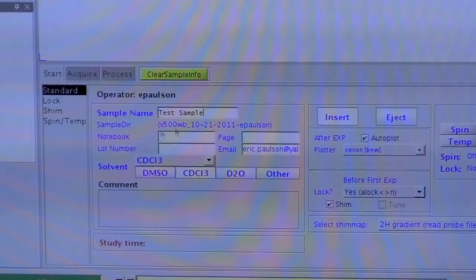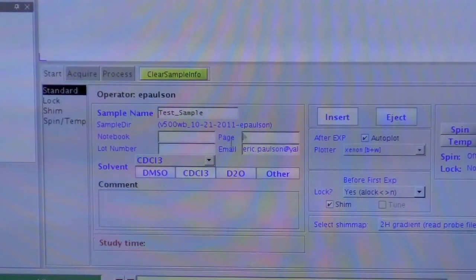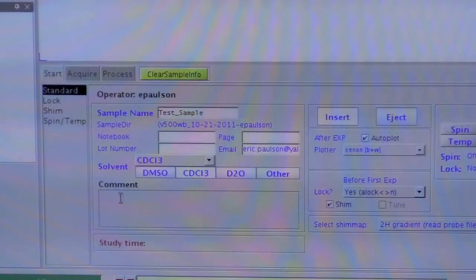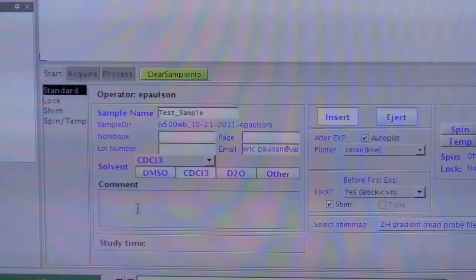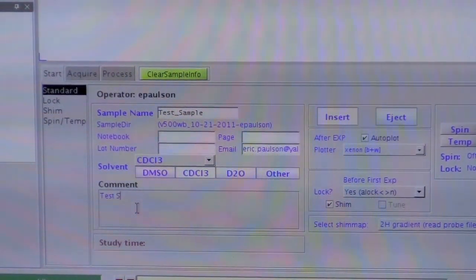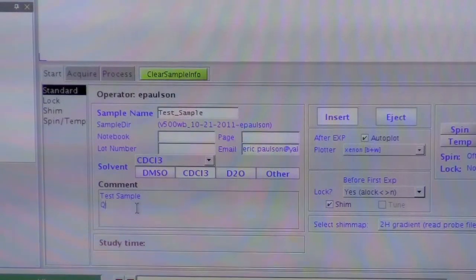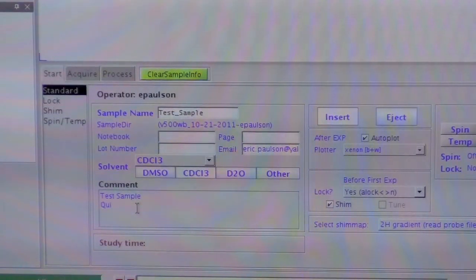You can also fill in these other fields if you want, but those are optional. So this comment box is similar to the title box on the Brooker spectrometers, so you can put whatever you want in here. You can put multiple lines of text.